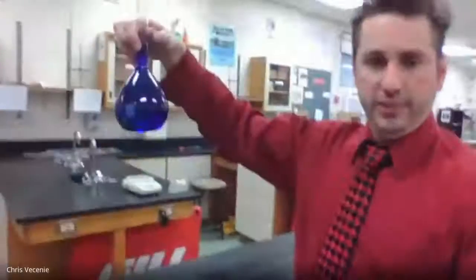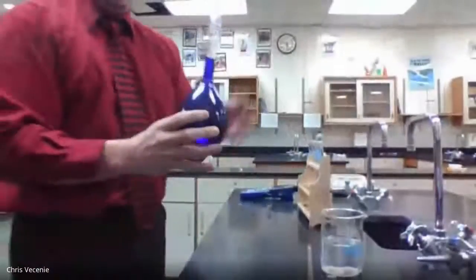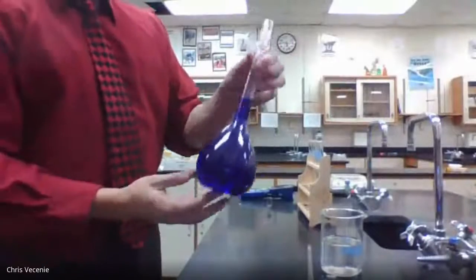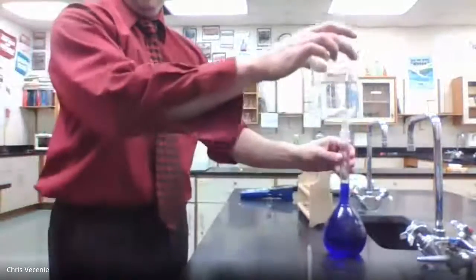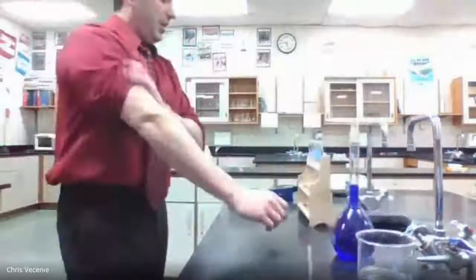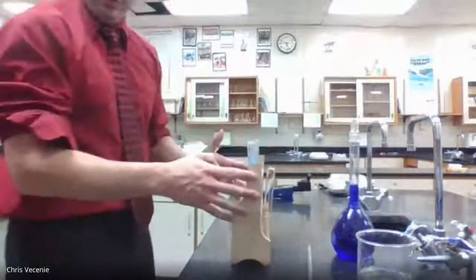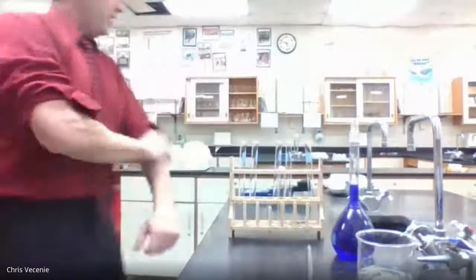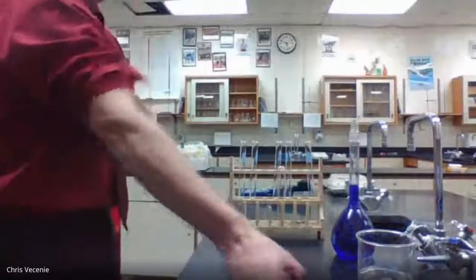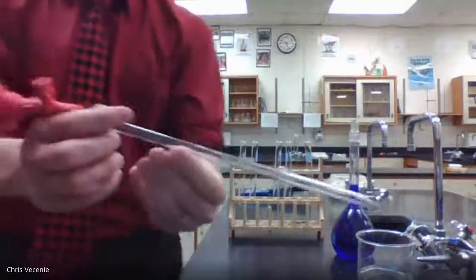All right, so this guy right here, this is my crystal violet. Very pretty purple color. All right, and this is my 25 micromolar. All right, here's my distilled water. And here are my test tubes. And here is a serological pipette. All right, and this is also a volumetric pipette.